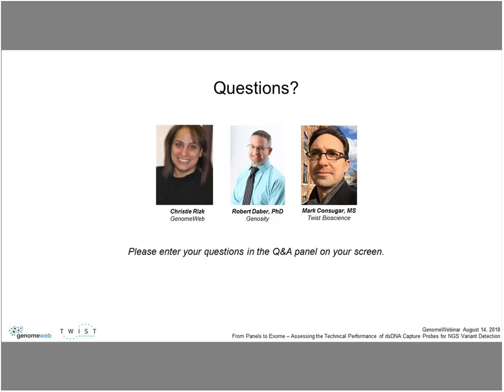Bob, the first question is for you, actually a series of questions about how you treat FFPE samples. First, do you always perform DNA end repair for FFPE samples, and what kit do you use for that? And second, how many total cycles of PCR do you usually perform pre- and post-capture for FFPE samples?